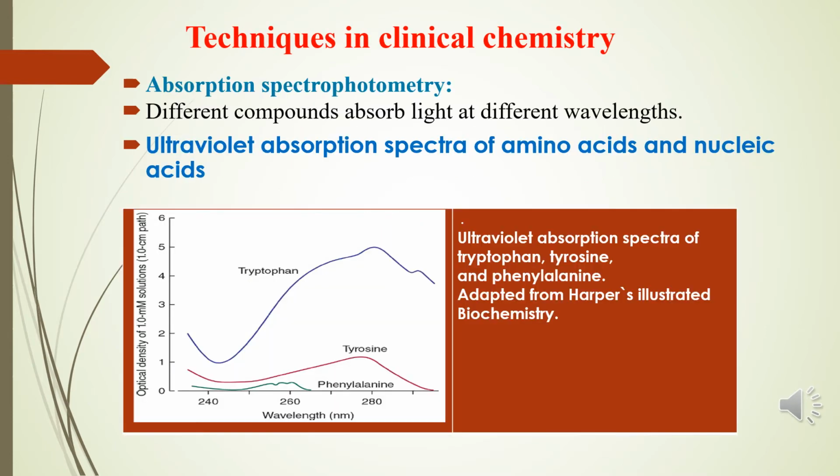The ultraviolet rays have some laboratory and clinical chemistry applications, as we can use the absorption spectrum of ultraviolet rays as well as the spectrum of other colors to determine the concentration of specific analytes or substances.